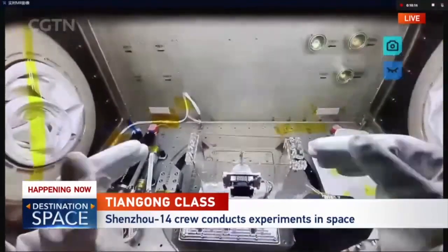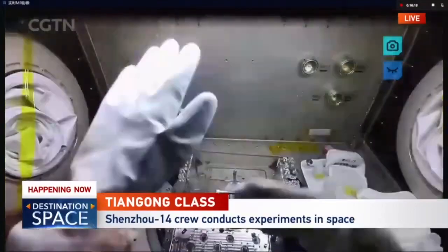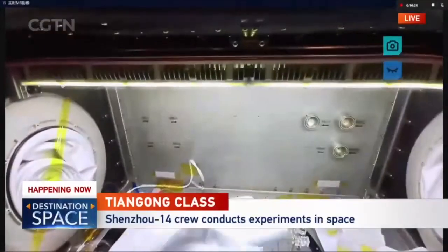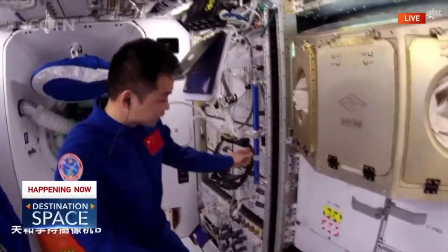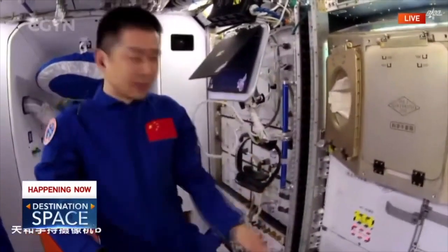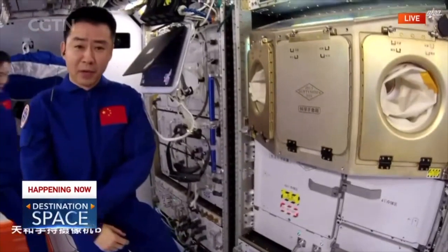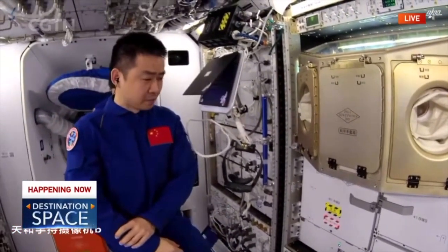After the class, I will continue to pick the samples and put them into the low temperature storage box. After I get all the samples, I will put them into the storage cabin at minus 80 degrees Celsius, and then I will bring all of the samples to the scientists on the ground.